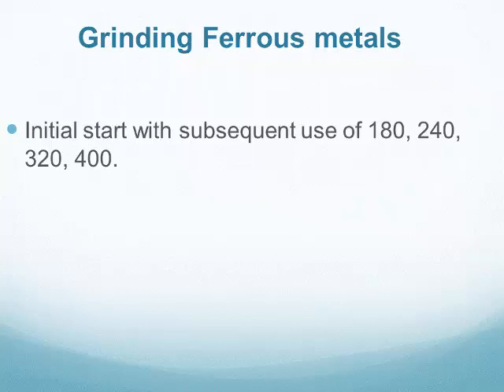After 5 minutes, you will change to 320, and after 5 more minutes will be 400.